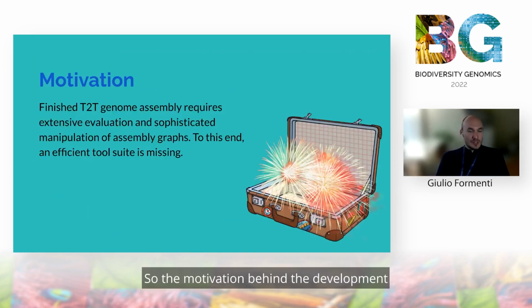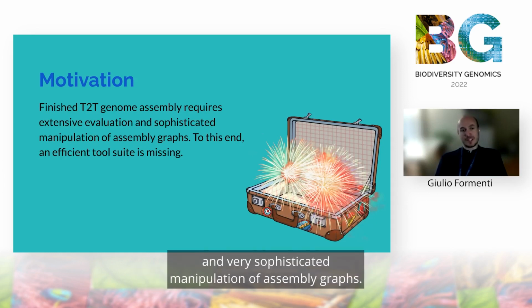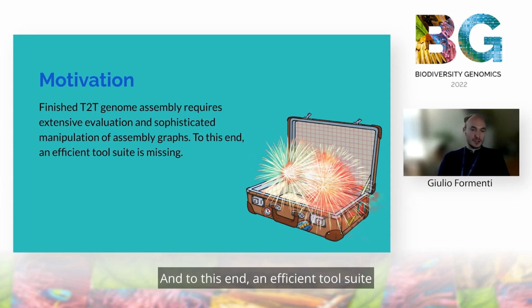So the motivation behind the development of Gfastar is that generating complete and accurate genomes, that is telomere to telomere genome assemblies, now requires extensive evaluation and very sophisticated manipulation of assembly graphs. And to this end, an efficient tool suite is actually missing.